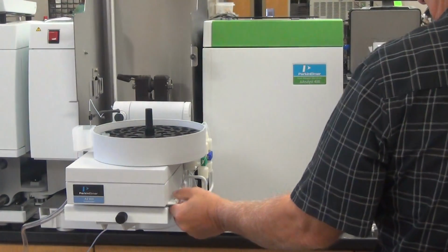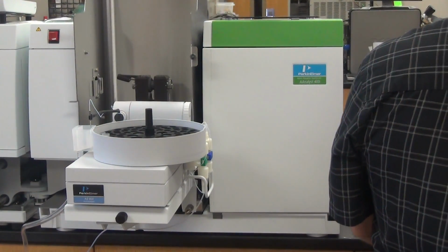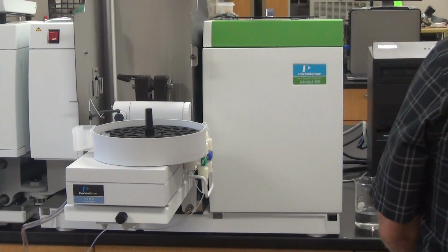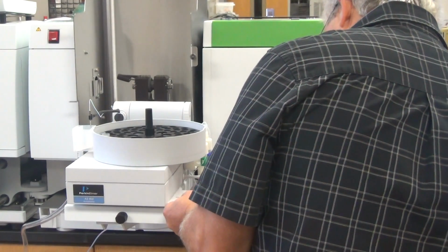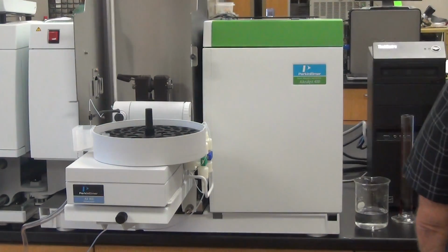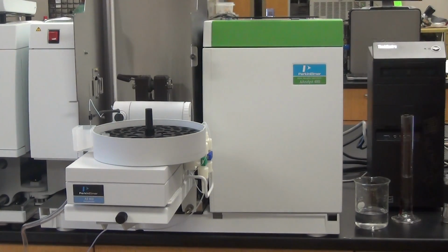And here's the little quick reference thing that talks about the auto sampler. It's stuck. You don't really do a whole lot. It's got some part numbers on it, and it's got its own little spot right there. So we get ready to run something, and let's go to position 1.